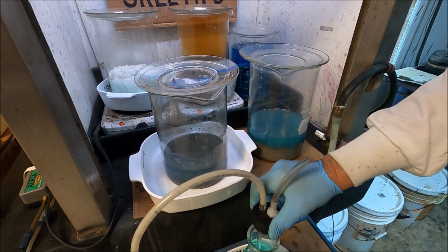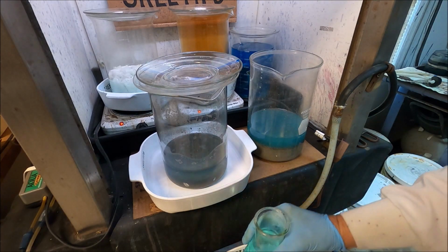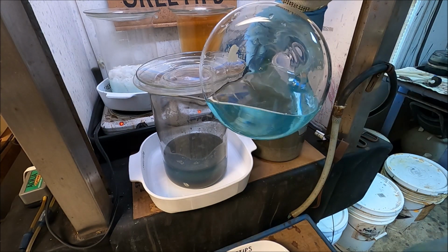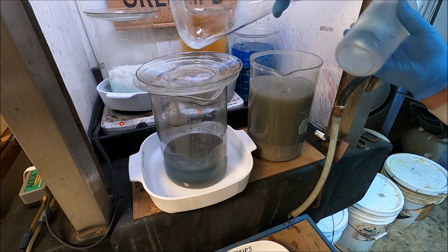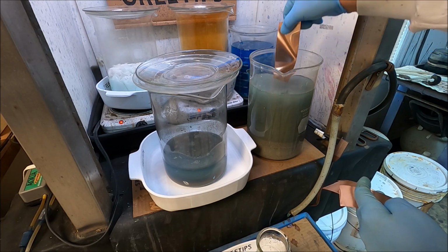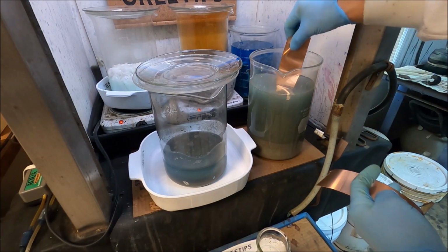Solution that we just drew off, it's going to have silver in it. I'm going to put that in this beaker right here. I'm adding some copper to this solution right here. It should have precious metals in it that will cement out on the copper. I'm just going to drop these right in.